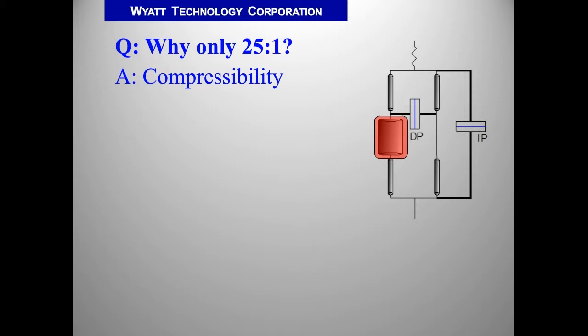And so for many years, people have gotten very good data with 4 capillary bridge viscometers, but they were limited by this effect. And traditionally what people would do is they would use electronic filters or software filters to simply try to smooth out the pump pulses so that they don't see them. And that has, unfortunately, the side effect of also smoothing out the peaks that we're trying to measure.